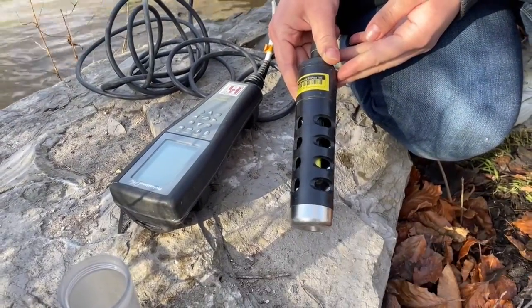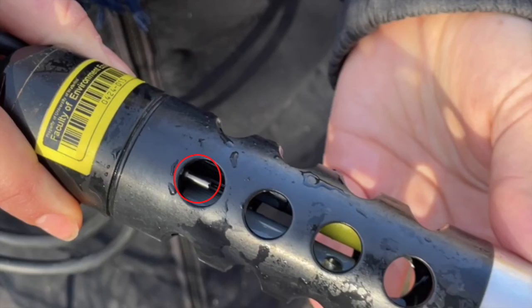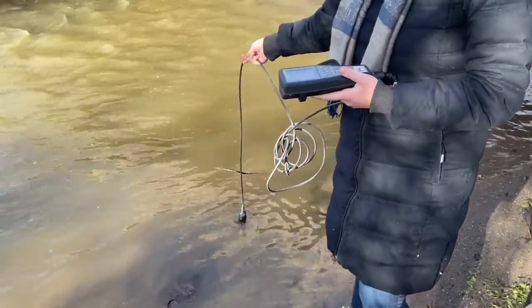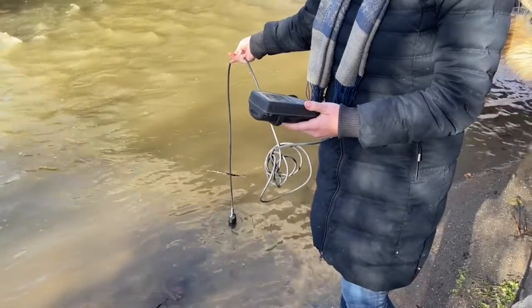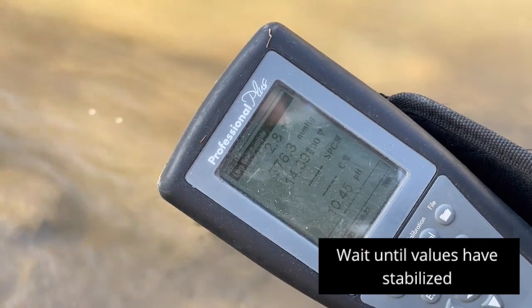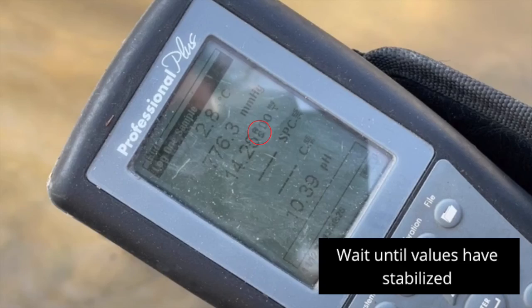When placing the probe in the water, you want to make sure that it is submerged up to the temperature probe, which is circled here. Make sure the probes are underneath the water, and if it's too shallow, you can also lay it on its side. Then take a look at the screen — you'll notice the numbers changing, so you'll want to wait a couple of minutes.